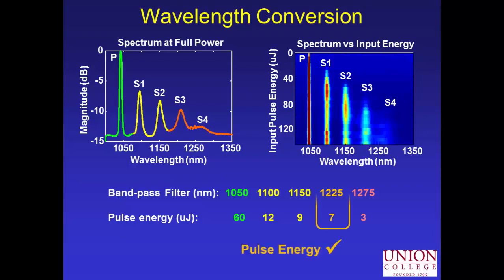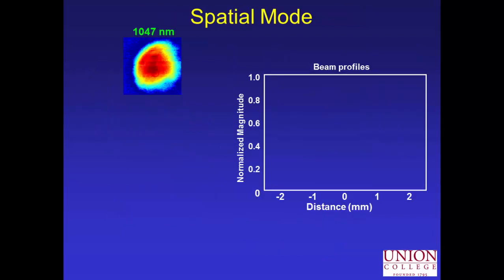And so that's good for situations where you have, for example, an integrated OCT and photoacoustic system, and you're going to focus your excitation anyway. So having about 7 microjoules of energy is plenty for that kind of so-called optical resolution photoacoustic microscopy system.